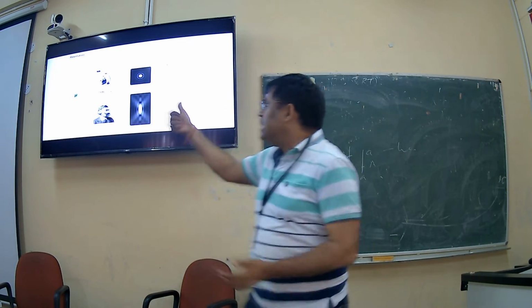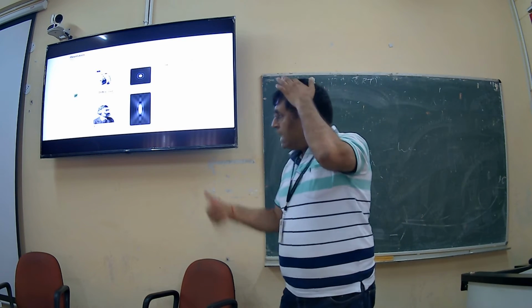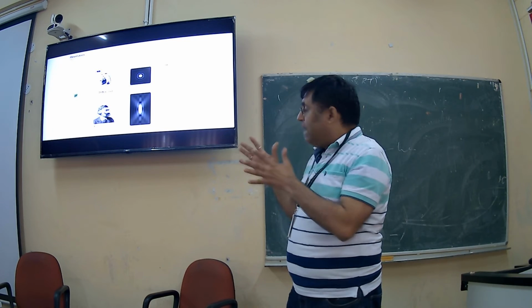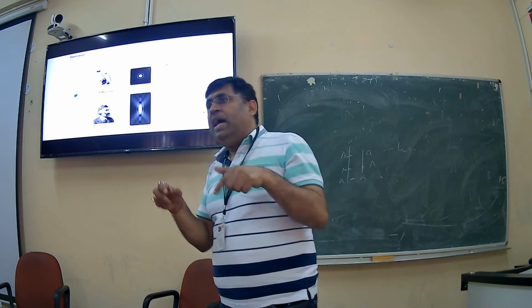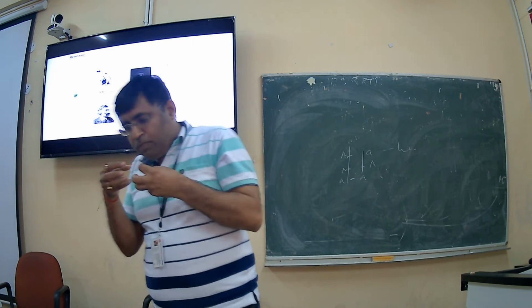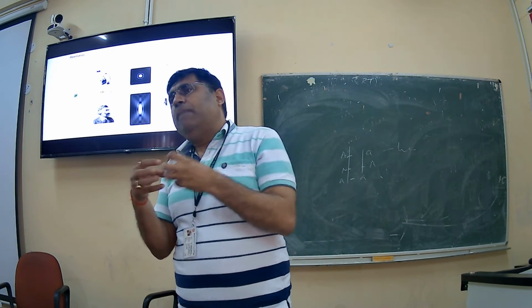So that is the diffraction phenomenon, and this was explained by Ernst Abbe, who told that light can be diffracted in the X, Y and Z directions. And due to this diffraction phenomenon, at very low dimensions, we cannot see two separate objects.